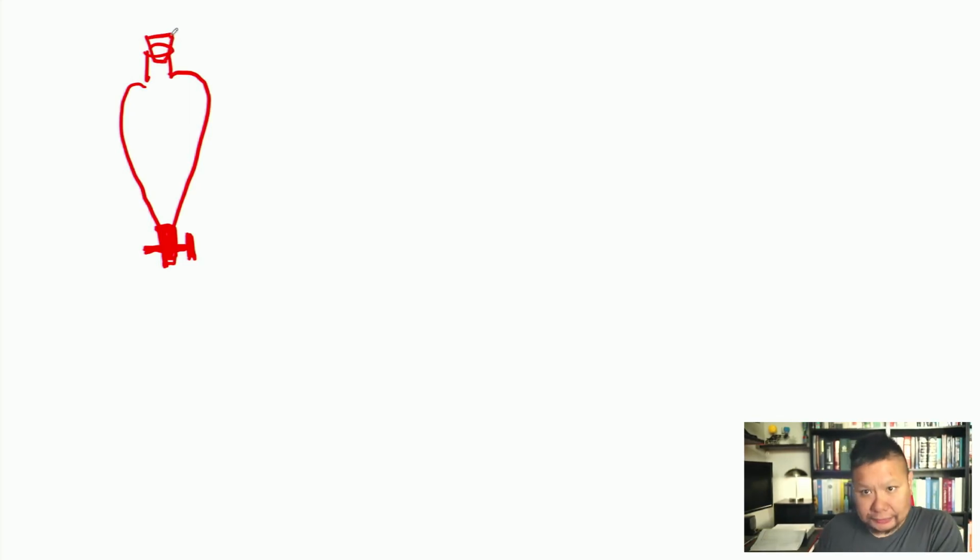So when you're doing a reaction, and you end up with a mixture of stuff, like your reactants, your product, and all this other stuff, the solvent that it came in, you've got to do something to actually clean it up, get rid of all the stuff in there other than your product, right? And generally, you'll start out by washing it with water to get rid of all of the inorganic, polar stuff that's soluble in water, that's not your product, right?